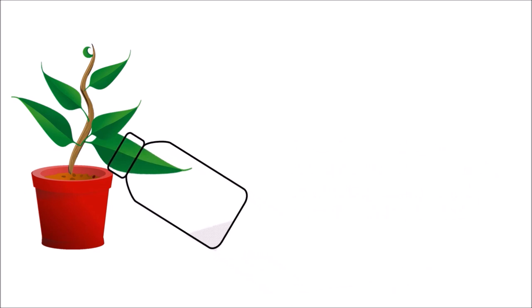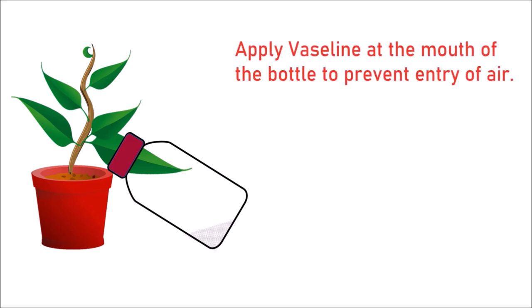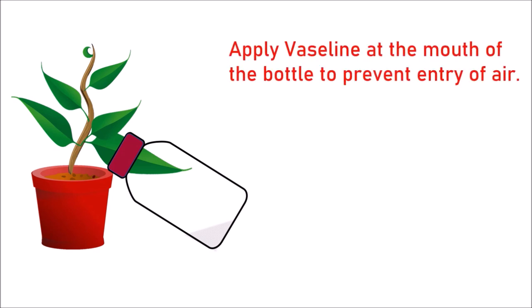Insert one of the leaves of the plant into the bottle through the mouth. Fix a split cork to the mouth of the bottle so that the leaf passes through the split without being damaged. Apply Vaseline at the mouth of the bottle to prevent the entry of air.